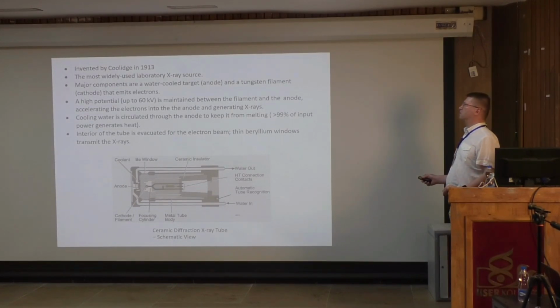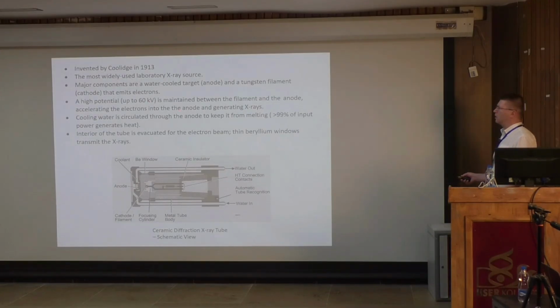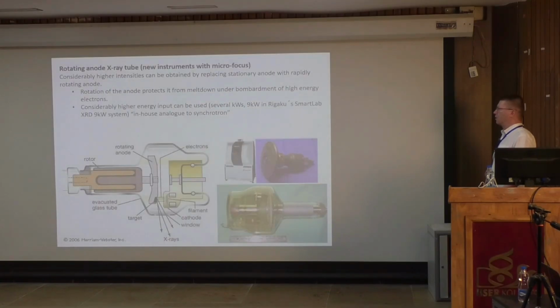This was invented more than 100 years ago. Of course, that's the idea. And the point is that it's still the most used one, because it's very simple. Many of the simpler instruments use this, because it's like plug and play. You just take it out, put it back, tune it a bit, and that's it. So it's very handy to use. Of course, you need electronics to create this high power and potential in there. But in principle, it's a very easy and old invention. This is called the old X-ray tube.